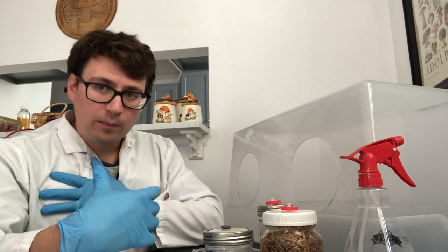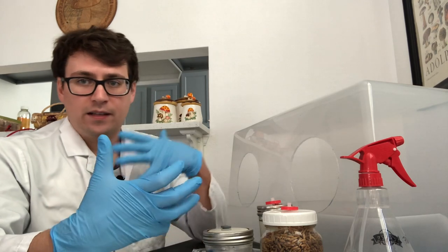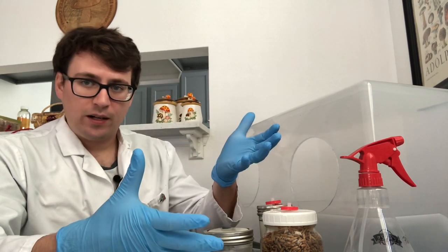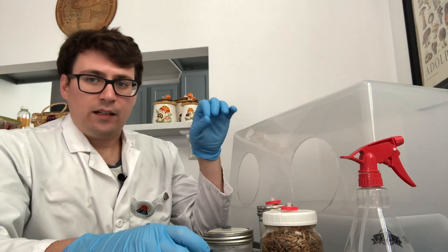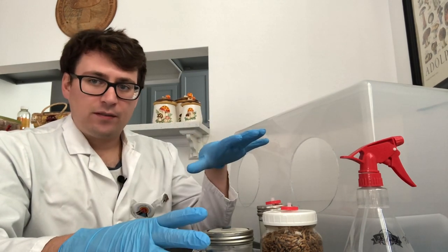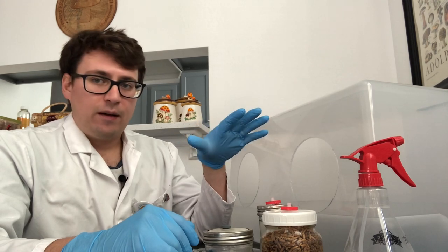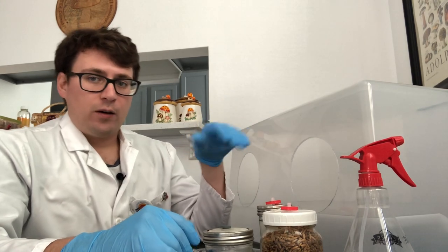To me that was the most important investment because of my laboratory background, but as far as a small scale or hobbyist farmer, you can definitely get away without a laminar flow hood.